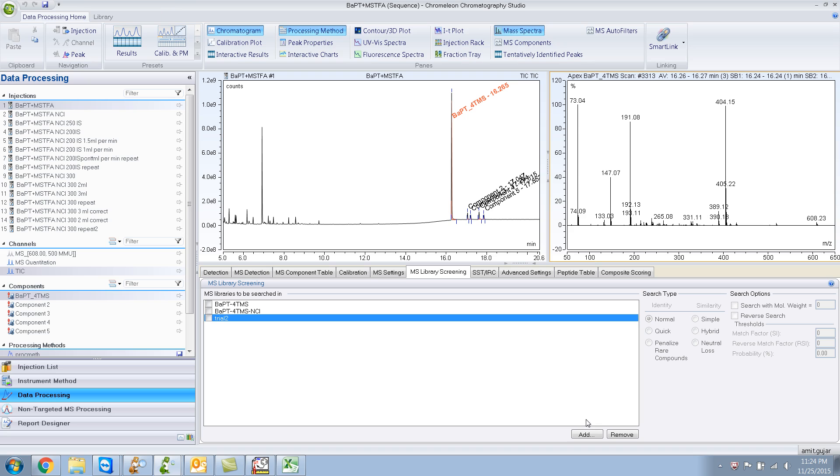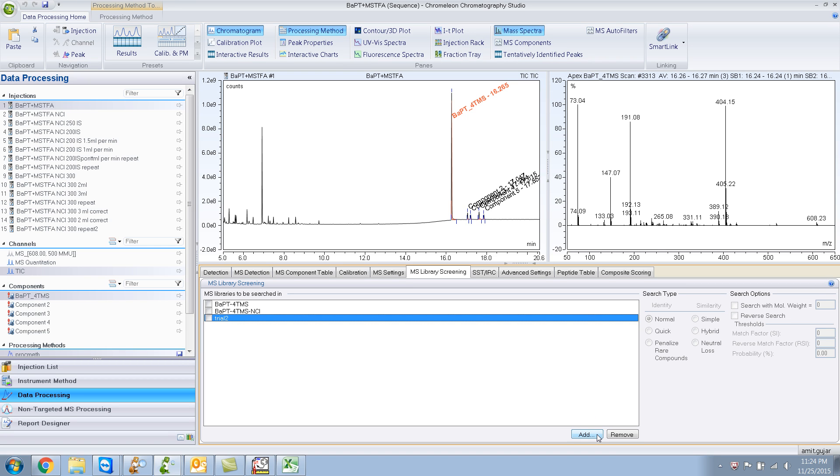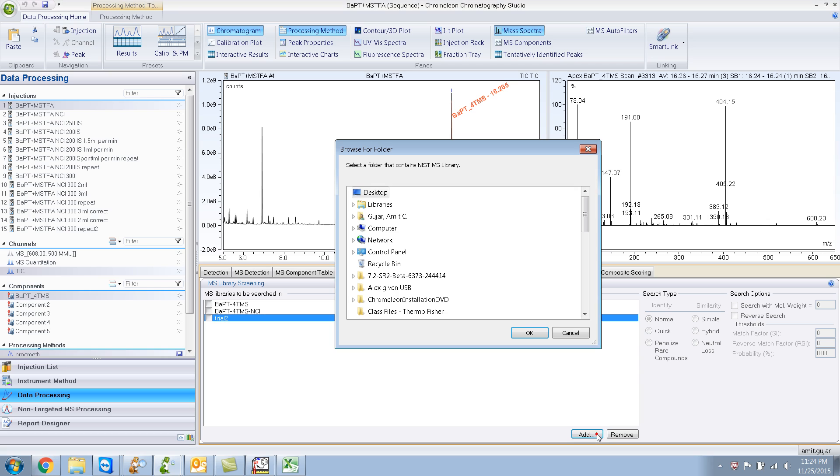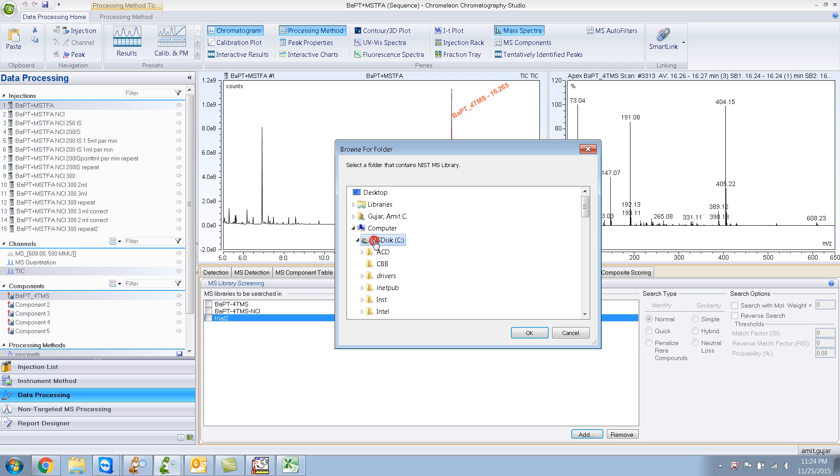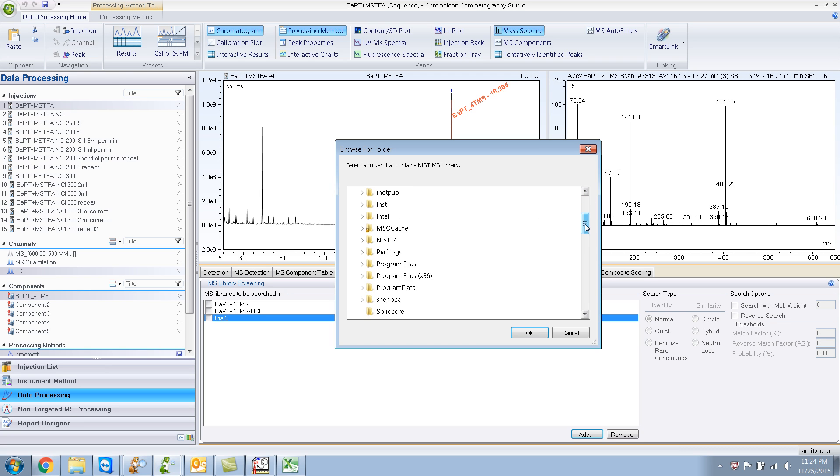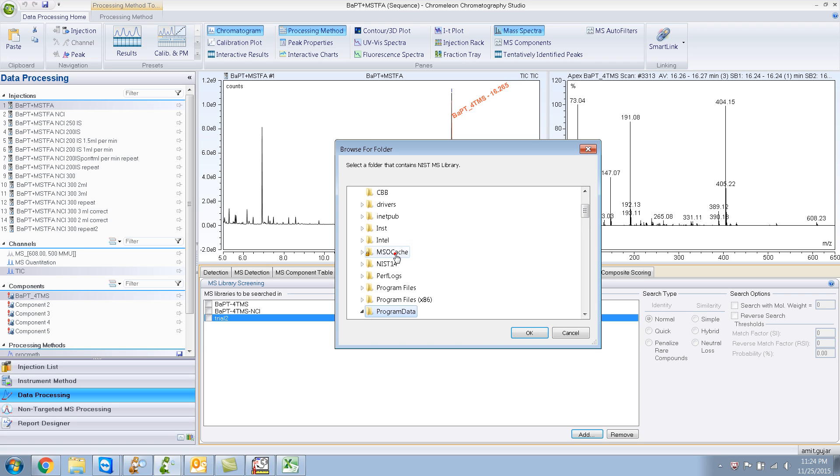So, the way you would do it is in the processing method, you would click add over here. And you need to remember this, where the library is stored. So, the library itself is stored under computer, C drive, and program data.